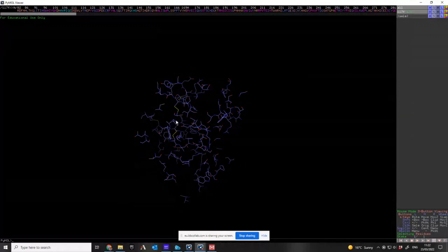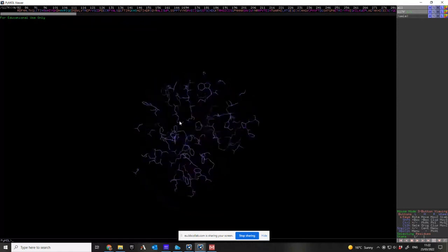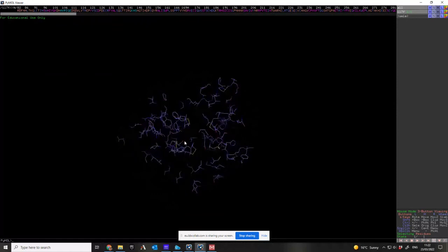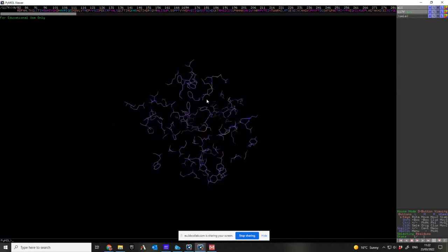Because these are both aromatic compounds, this is called pi stacking. It means their pi bonds are stacked to each other. It's the same as in graphite in chemistry. So by looking at this carefully, you can begin to explain the chemistry of how this thing works and why it folds. So that is the objective of one of the projects.